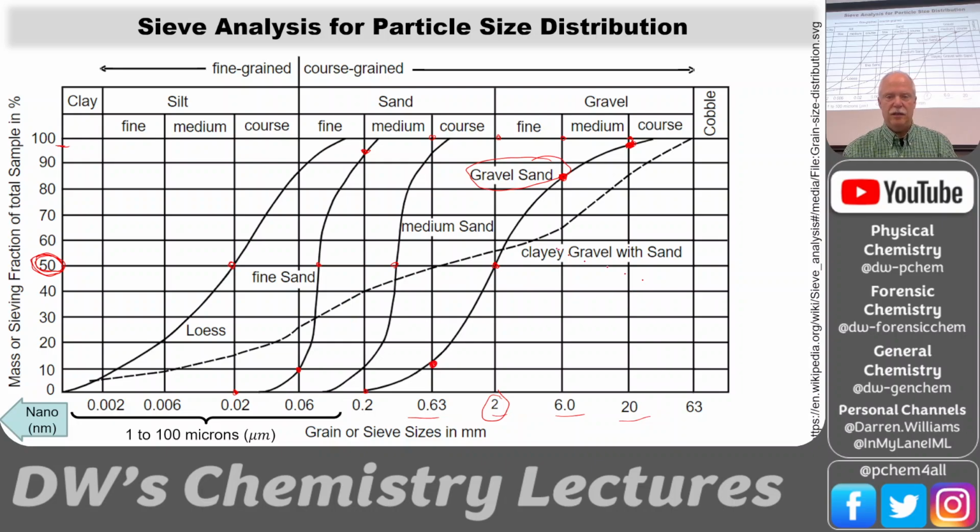Now, I don't know if this is a typo or if I'm just not a geologist, but clay, I don't know what clay is. But anyway, clay, gravel, and sand. So this is multimodal. Why do we say that? Well, because it's got this little steep portion here, and it's got a little steep portion here. So remember, this is the integral of a distribution. If we take the derivative where it's steep, you've got a high slope, and then it comes back down, and then it's steep again over here. So this dotted line would be the integral of this curve here. And so we see multimodal.